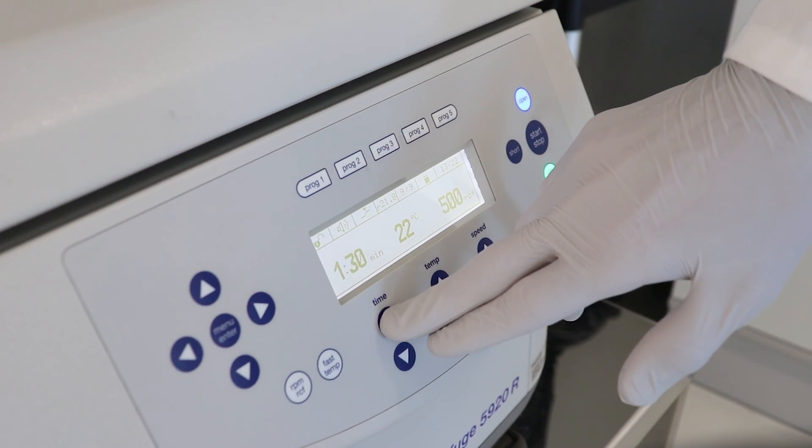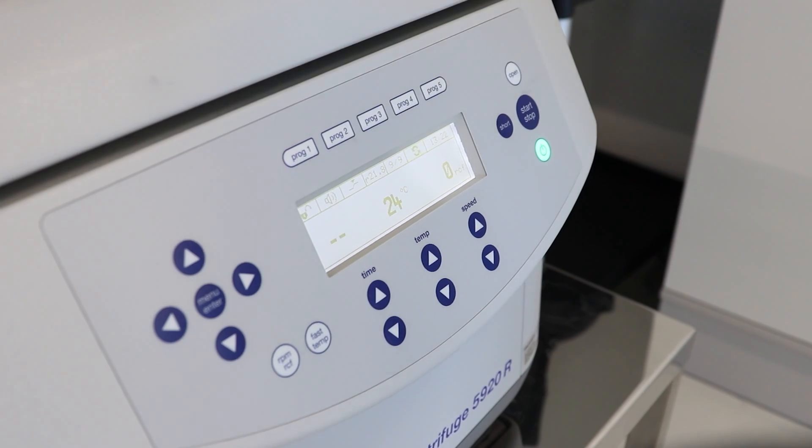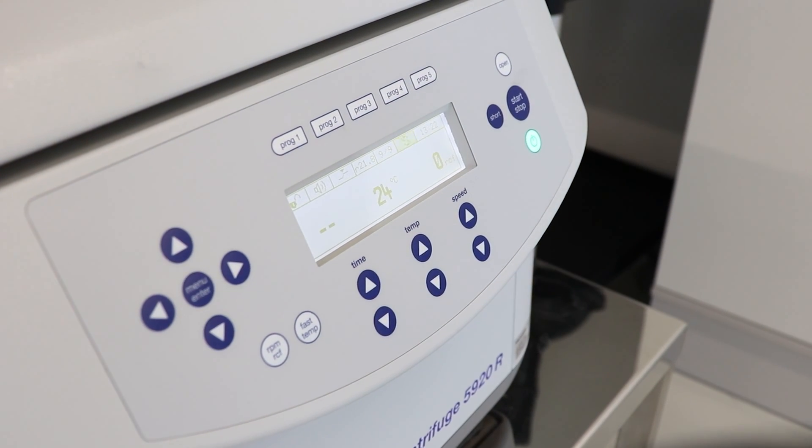The subsequent steps of washing and equilibrating the plate should be carried out based on your specific plate chemistry and target molecule.